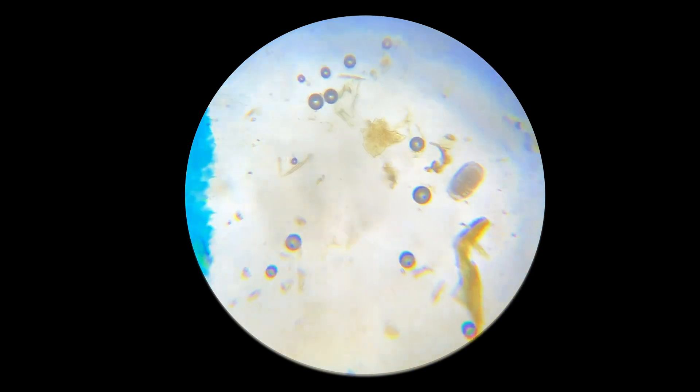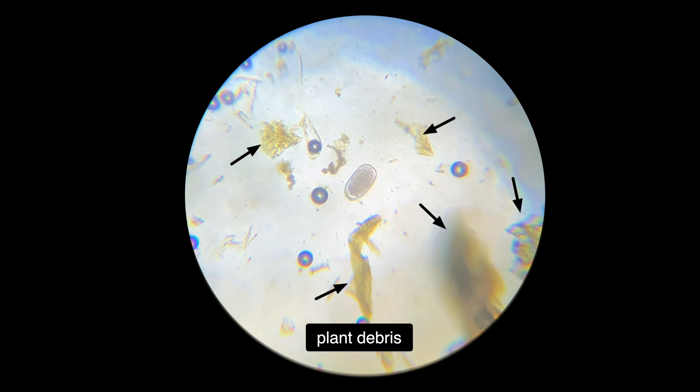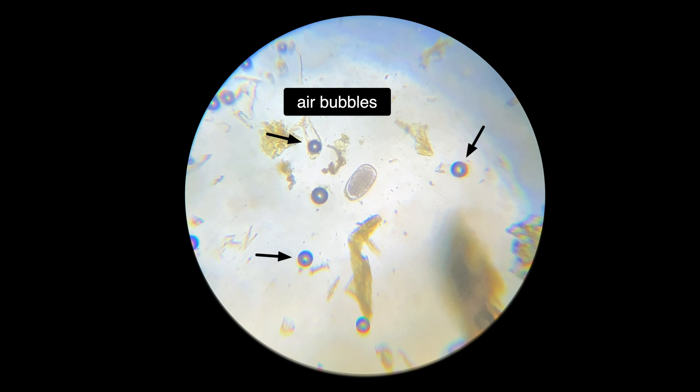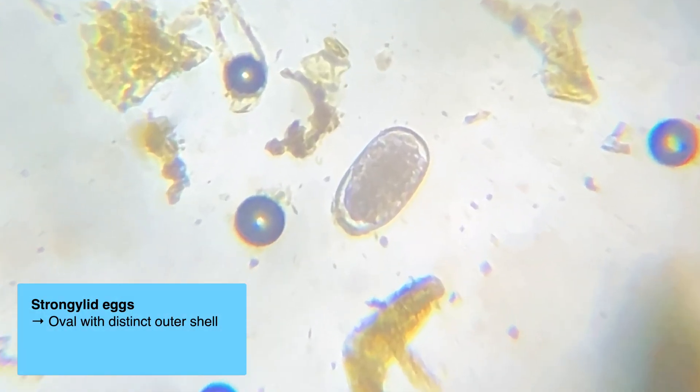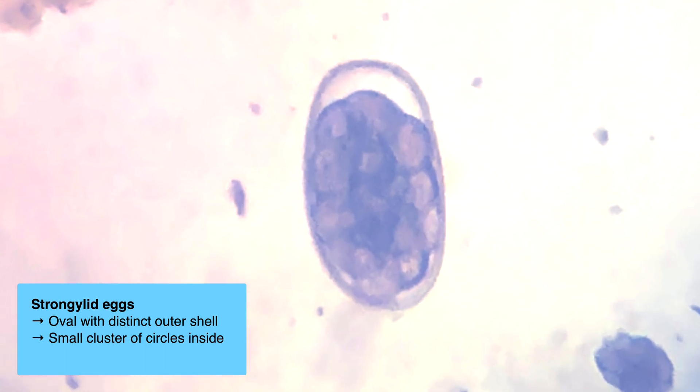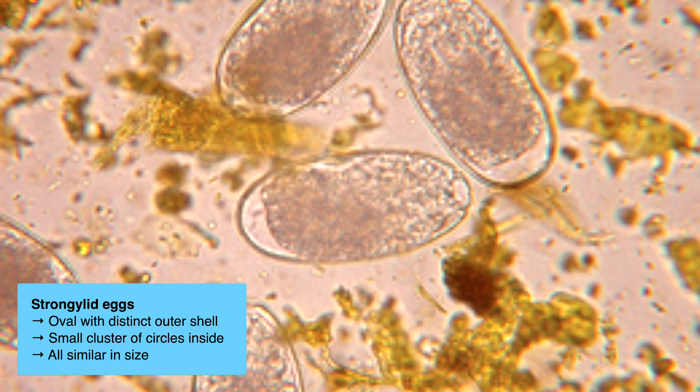Now let's talk about how to identify parasite eggs. First, note that the majority of what you're going to see is plant debris, which will be irregularly shaped and brownish-yellowish in color. You will also see air bubbles, which appear as well-defined circles with thick gray edges. In terms of eggs, you're primarily looking for strongylids, with the most prominent being the Haemonchus, or barber pole worm. These parasites cause the majority of issues in our goats and sheep. Strongylid eggs are oval in shape, with a distinct outer shell, and within the shell you'll see a smaller cluster of circles. All strongylid eggs will be similar in size — if you're seeing things of a lot of different sizes, it's probably not an egg.